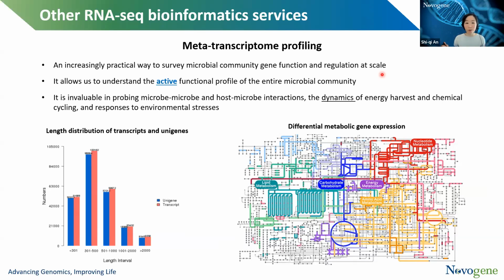From your sample prep, to which type of library would suit you, there are options. How do you choose different services that suit your purpose the best, also different platforms that you could use for your project, and some recommendations for the depth, very general as well. So I hope that helps.